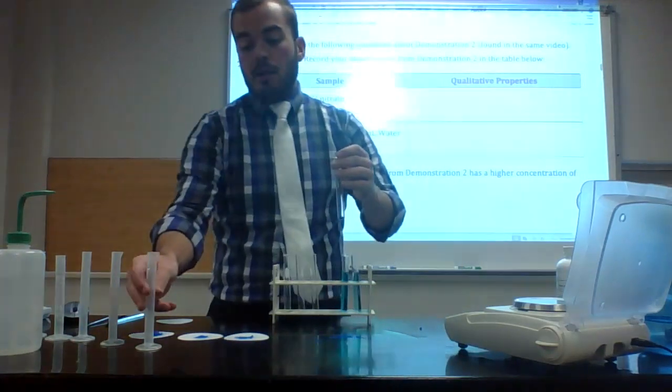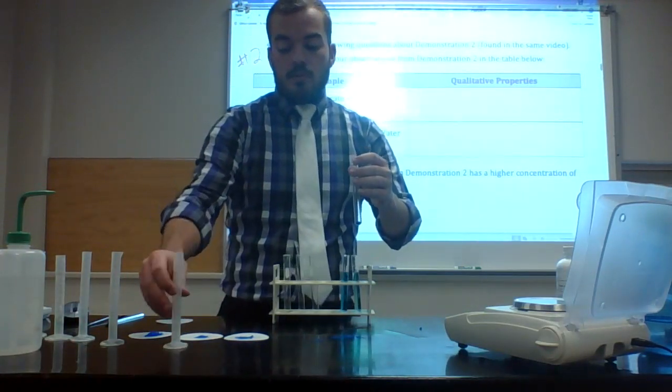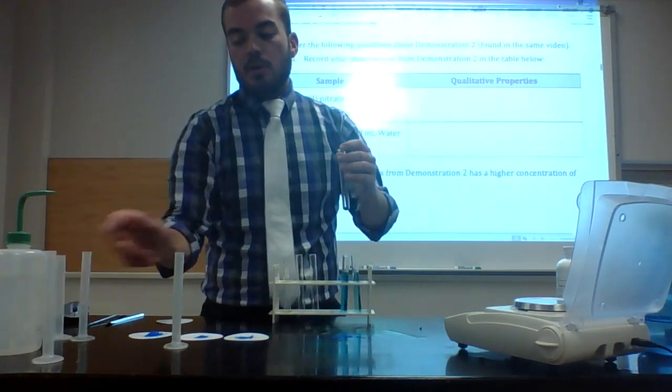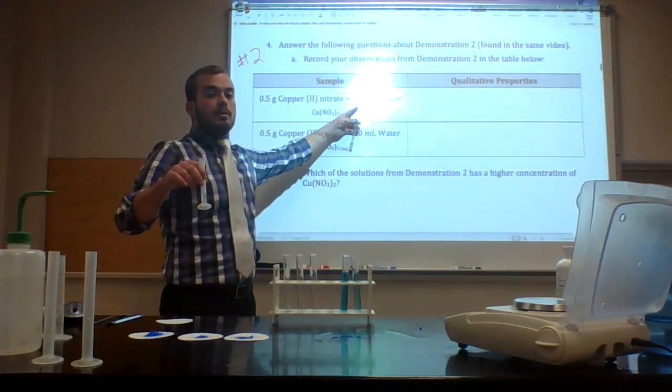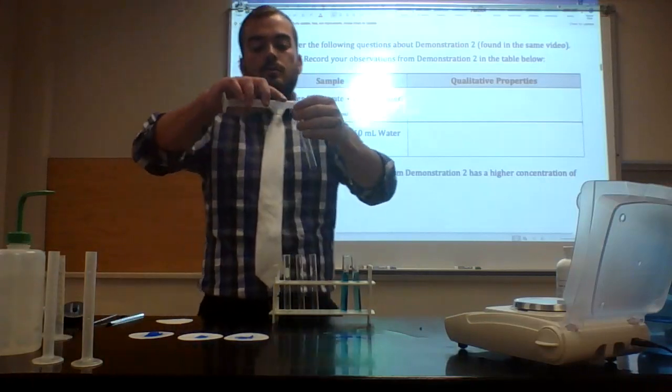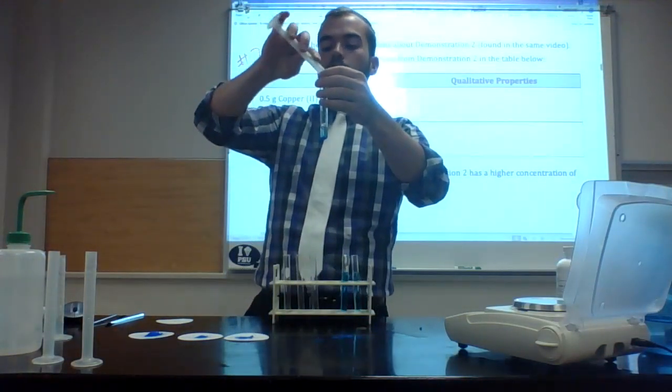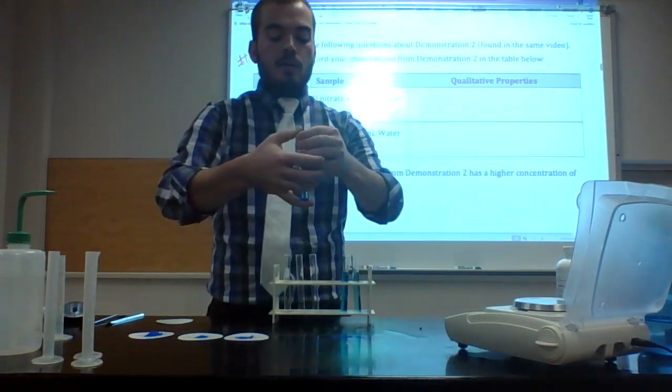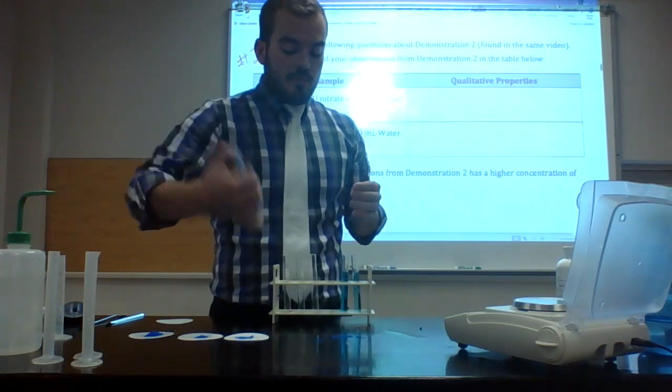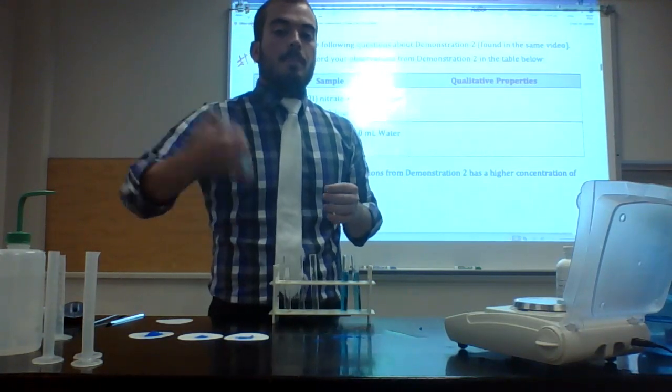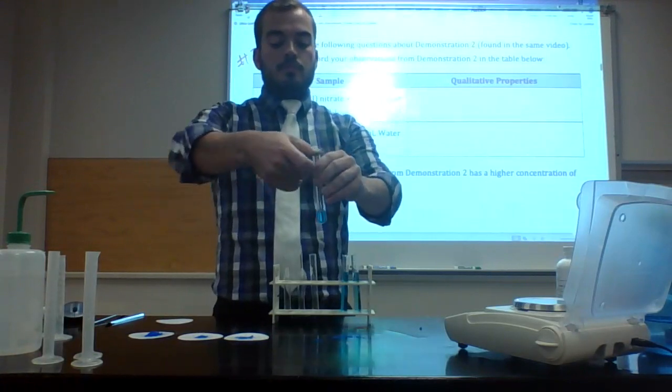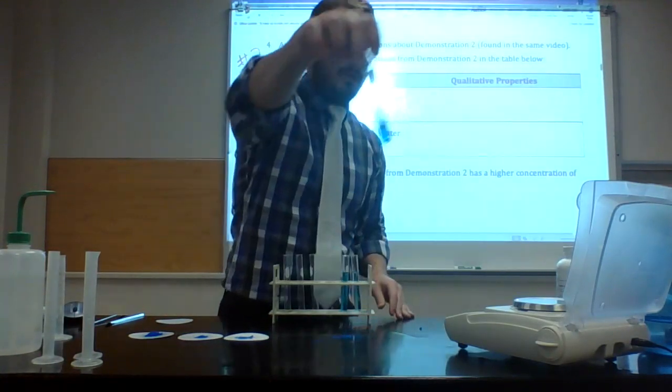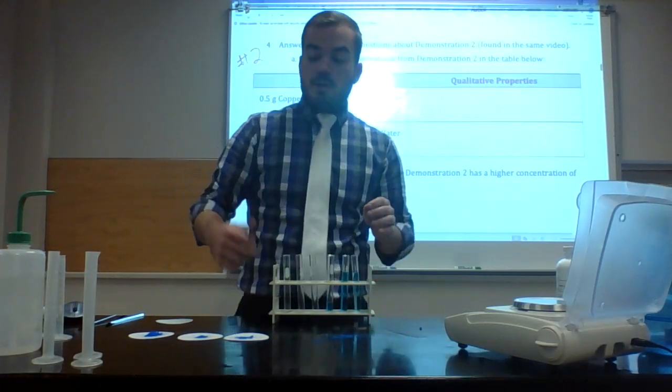I'm going to take 2.5 milliliters of water. Once again we got our blue solution. I won't give you a lot of time to look at that because it'll be better if we compare them.